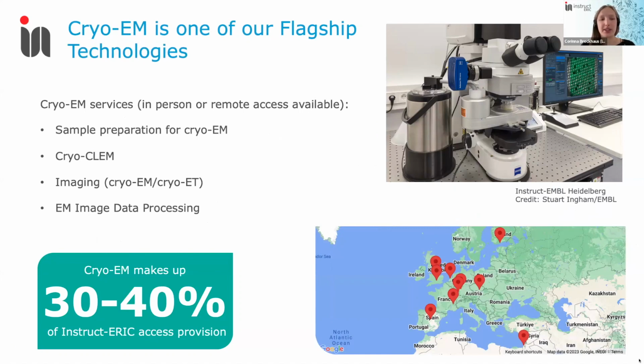About 30 to 40% of all access provision through Instruct is cryo-EM. And here we offer services for the complete cryo-EM pipeline, from sample preparation for cryo-EM to cryo-CLEM, high-end data collection for both cryo-EM and also cryo-electron tomography. And once you have obtained your data set, we also offer support in EM image data processing.